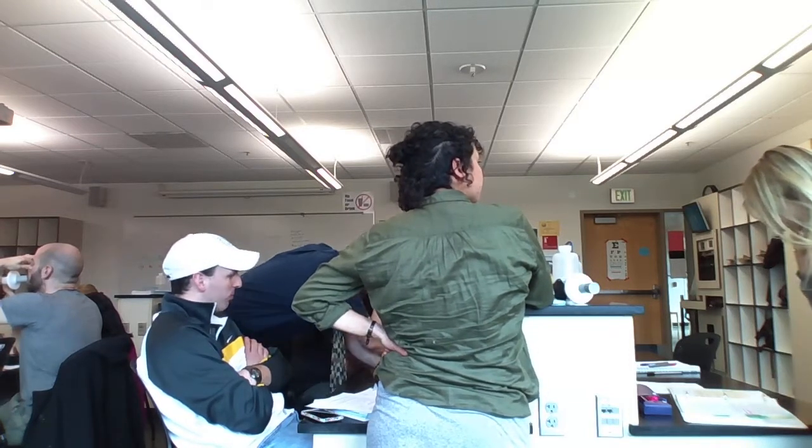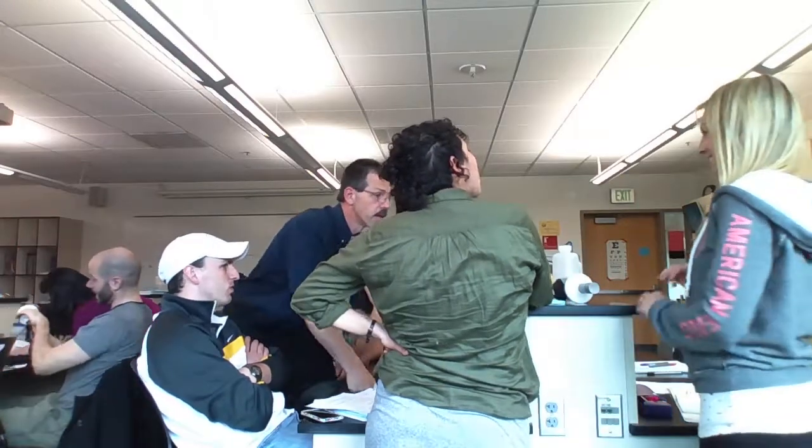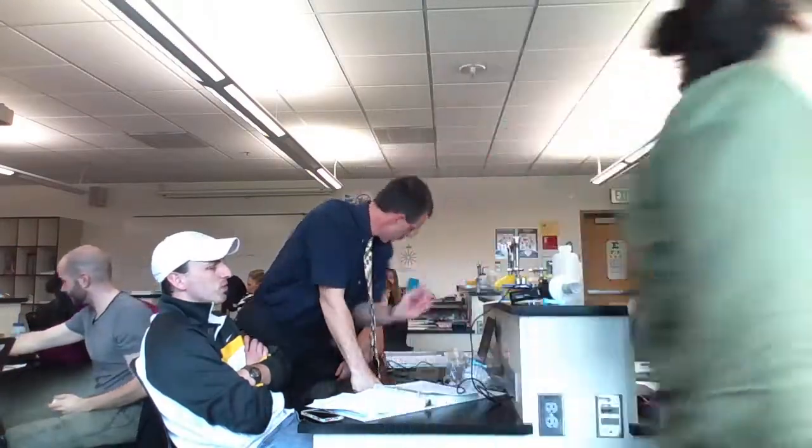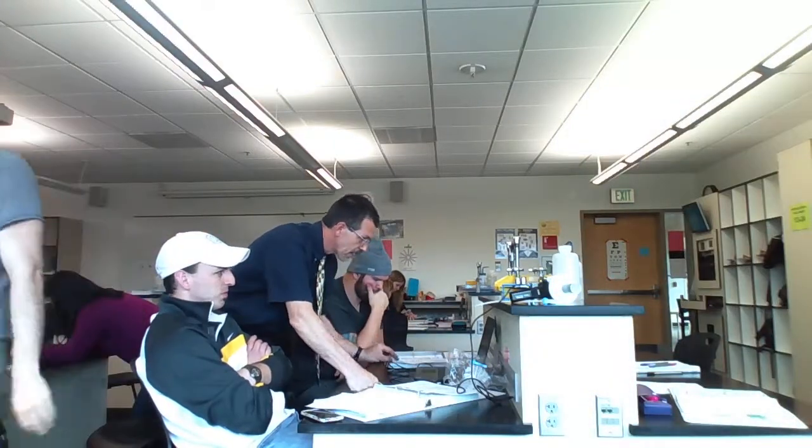Okay. Volume. Put those on the right way. Inlet. Yep. Okay, so now it should do it. If it doesn't, then we'll just have to fix the machine. That should work. You're up again.